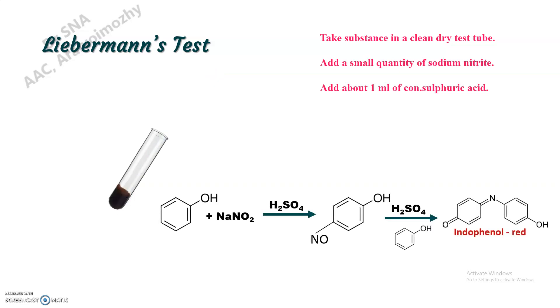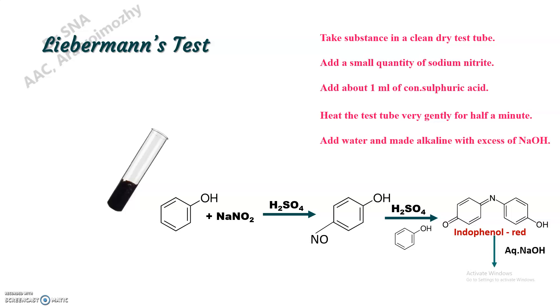After adding concentrated sulfuric acid, we can heat it for half a minute. After heating, we will be getting the endophenol dye, which is actually red in color in acidic medium due to its uncharged form. Now to this we can add some water and sodium hydroxide.